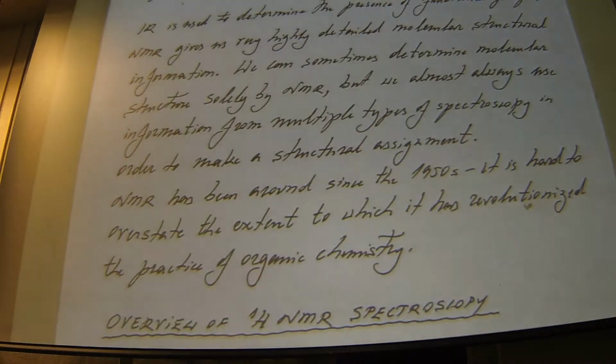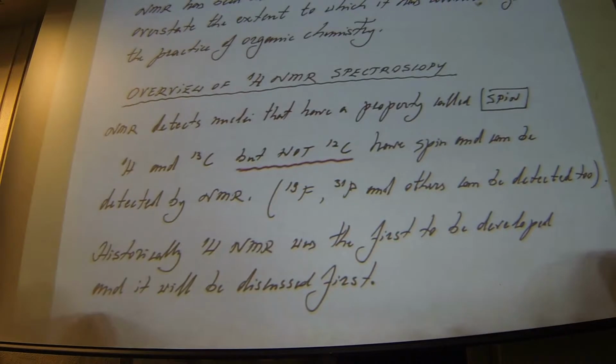Let's take an overview and see what exactly this thing is. So it is spectroscopy. It's not a destructive technique like mass spec. So after you run your NMR sample, you have your sample back. You don't lose anything, which is kind of nice. It's also very, very sensitive these days. You don't need a lot of material. In the old days, you needed really macroscopic amounts of material.